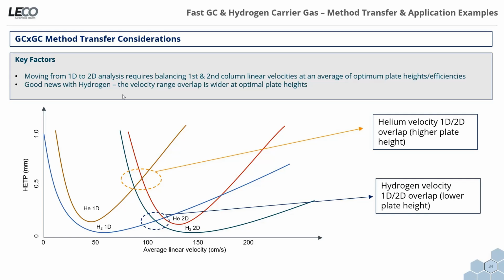Let's take a look at GC times GC method transfer. So for two-dimensional separations, there are a number of factors that need to be taken into account. We'll just take a look at some headlines here today.